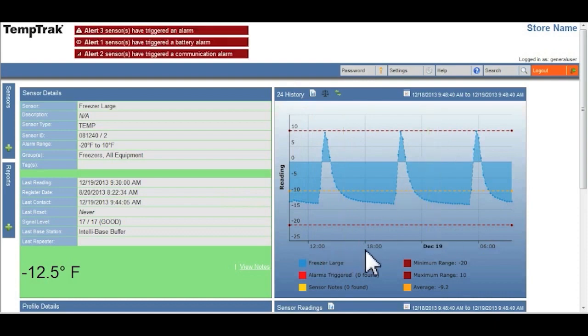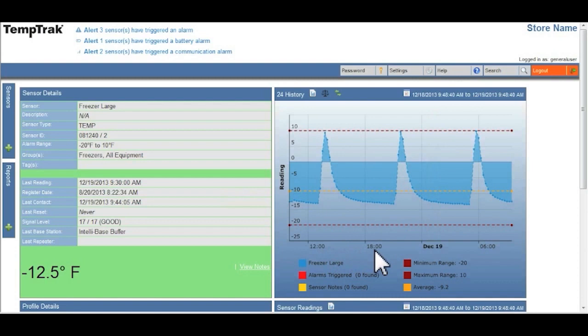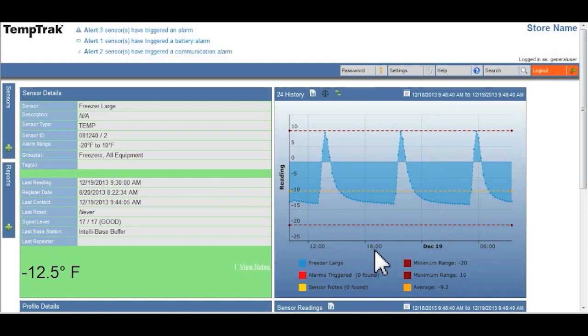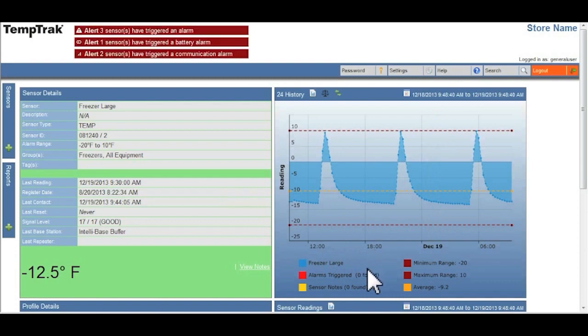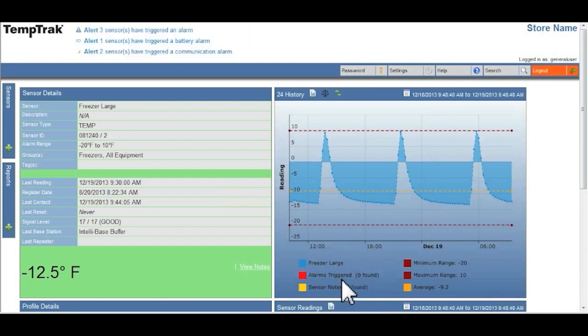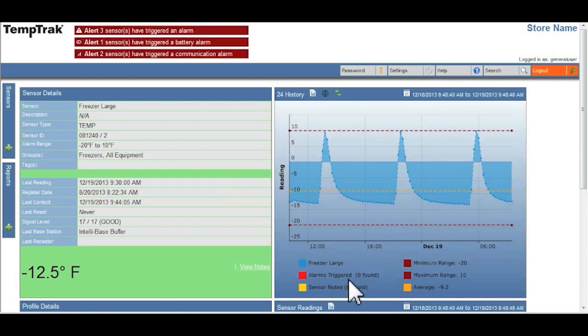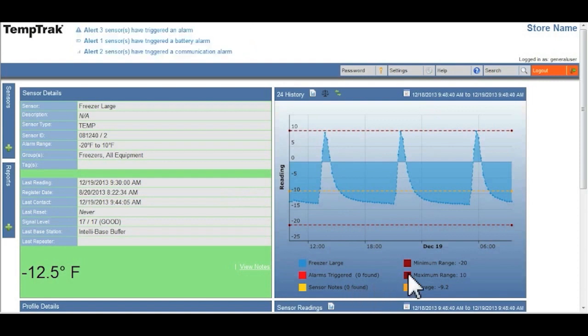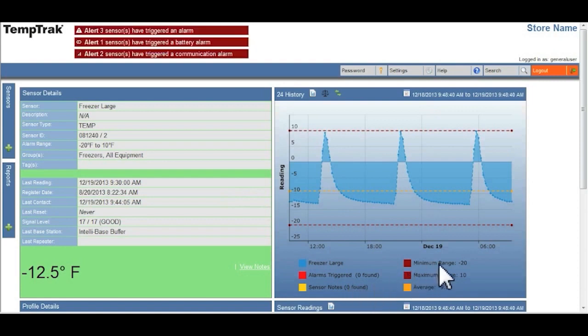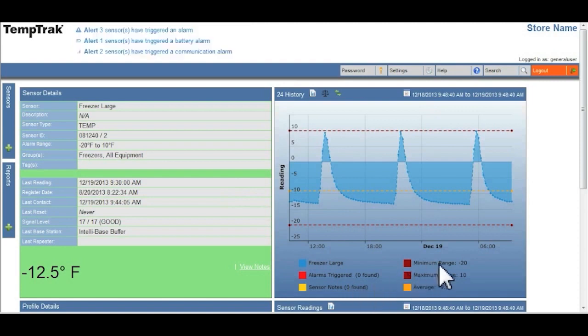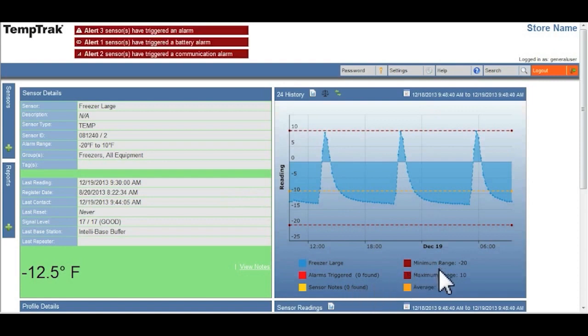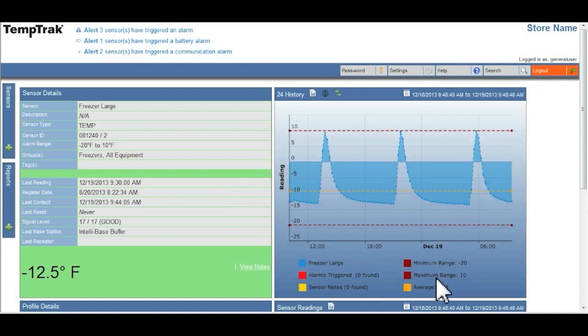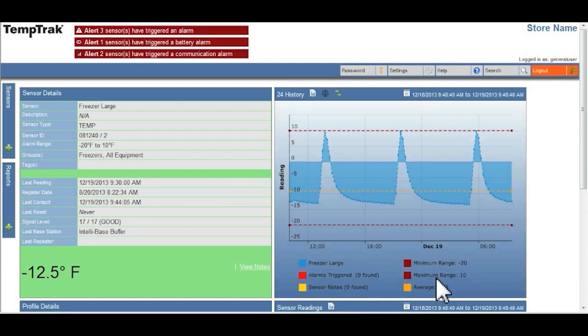In the bottom part, it will let you know whether there were any alarms, any notes associated with this particular piece of equipment, what the minimum and maximum range that was set for this equipment, and what the average temperature has been over the last 24 hours.